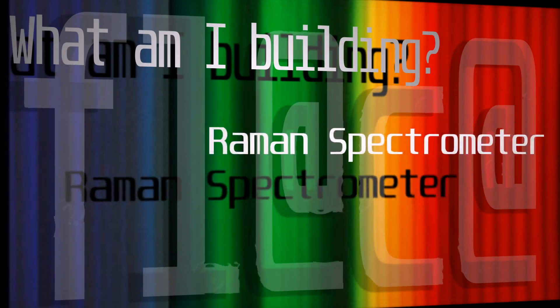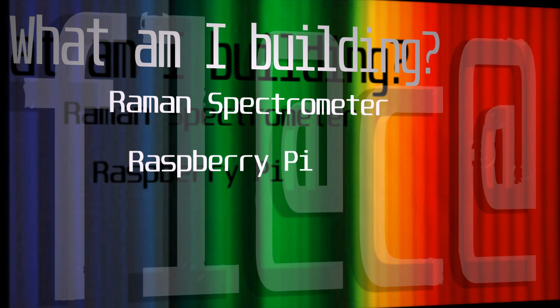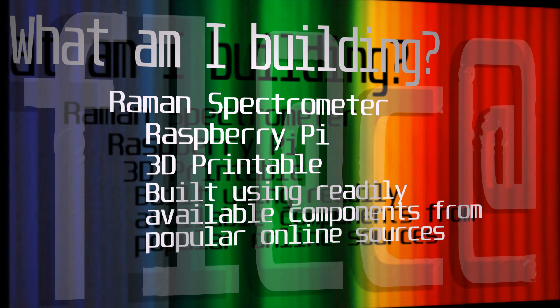I am building a Raman spectrometer based on a Raspberry Pi. It is 3D printable and built using readily available components from popular online sources.